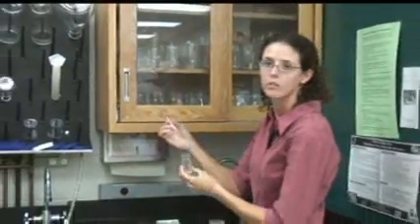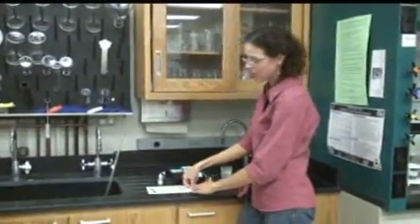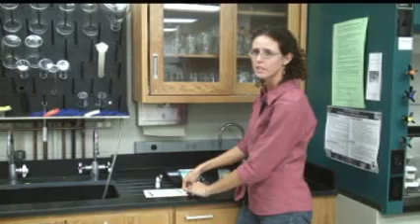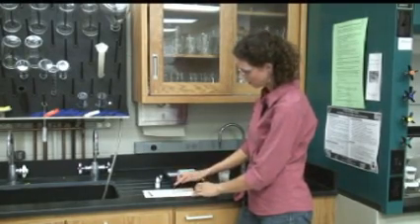Then you'll let it set for two minutes for the color to develop. These don't fade as quickly as the strips, so if you're over two minutes, don't worry about it.